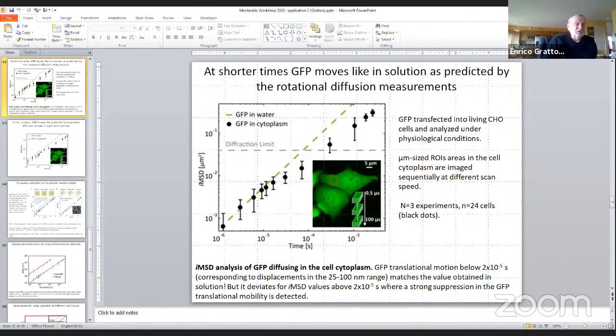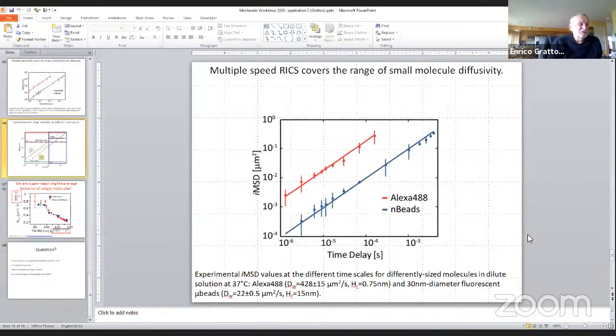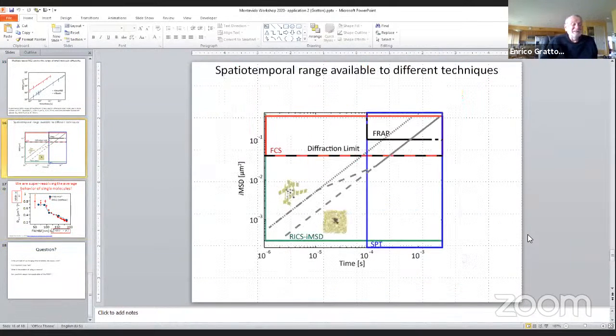Here also, you have a line scan, but the line scan is extremely powerful, because you can count the order of magnitude, and in this side there is no limit. I try to summarize in this graph, so that the normal technique and the FCS are here. But then when you use this line scan, you open up the space completely. Totally.